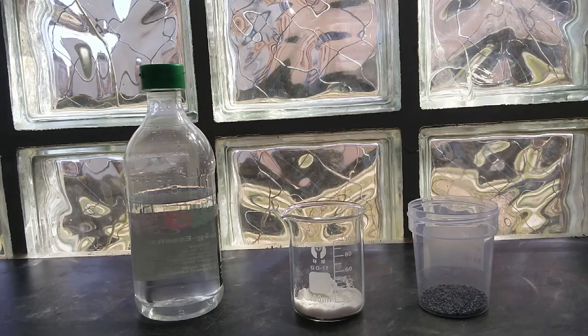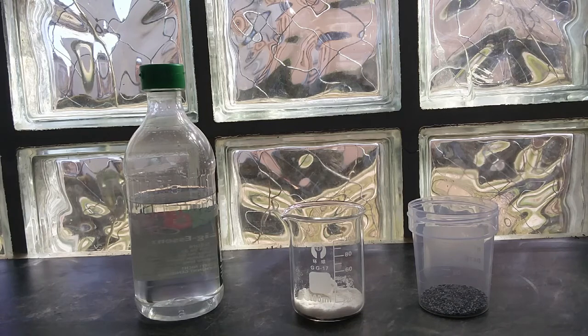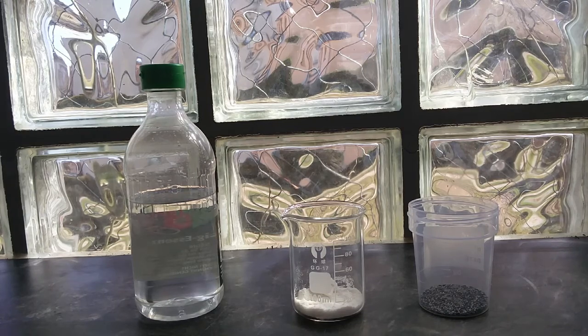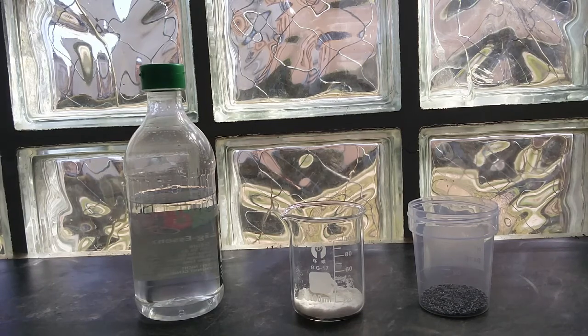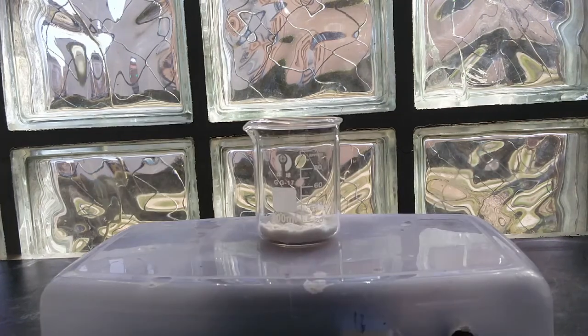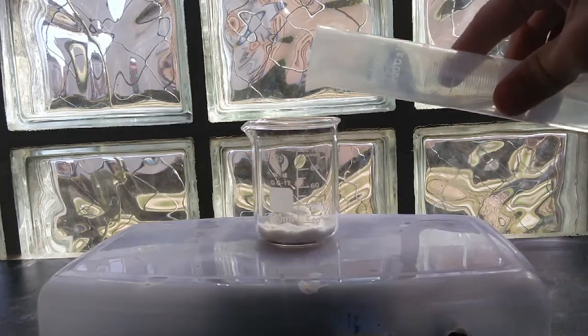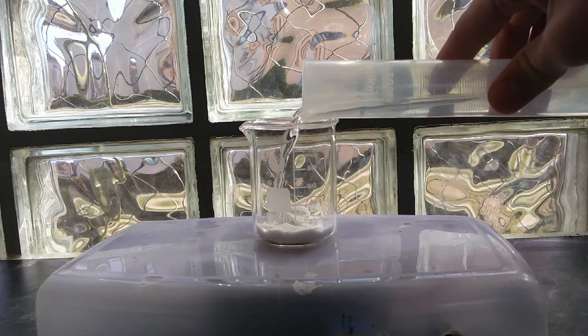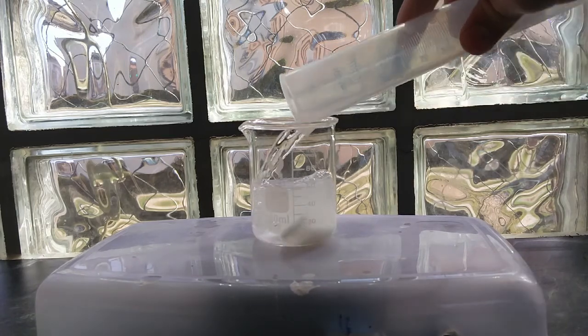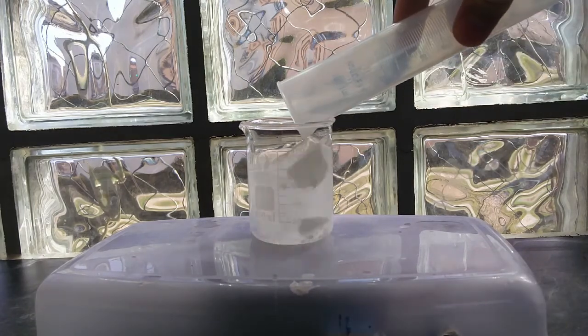First we prepare a solution of potassium nitrate in water. We dissolve 10 grams of this in about 50 milliliters of water.